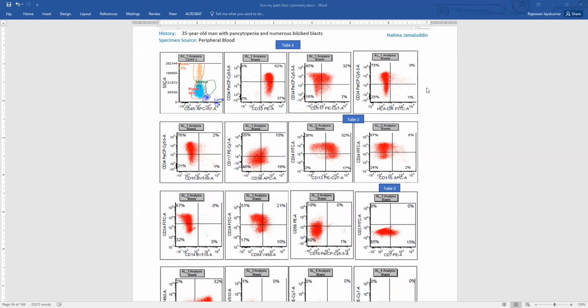So these three are pretty consistent in all types of APL, but there is a variant, acute promyelocytic leukemia, which is called microgranular acute promyelocytic leukemia. So these microgranular variants usually can have some CD34 expression and some CD2 expression. So that's what we're showing here. And the bright CD33, negative HLA-DR, and high side scatter still is the same. They can have partial CD34.